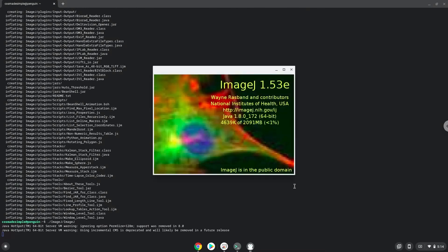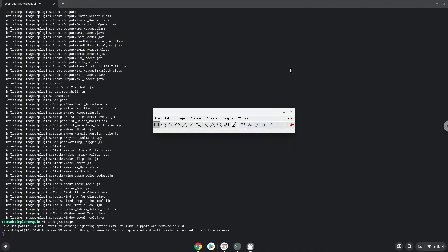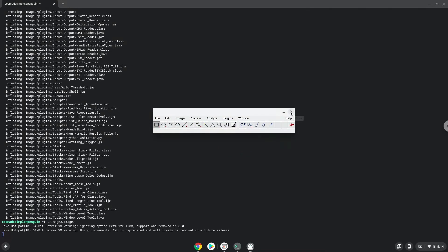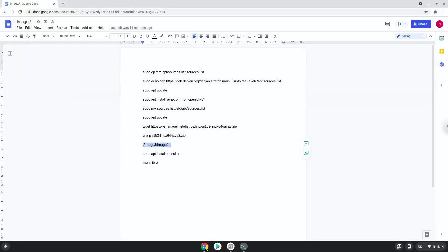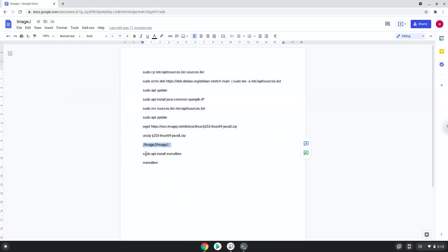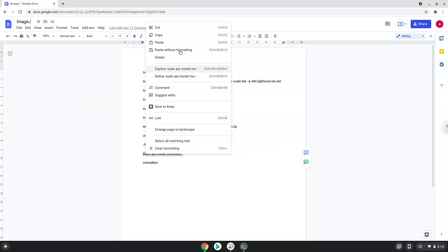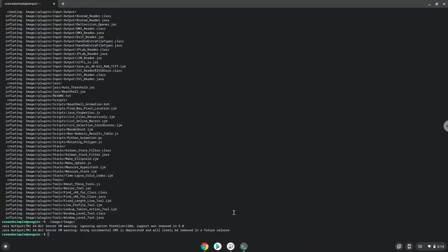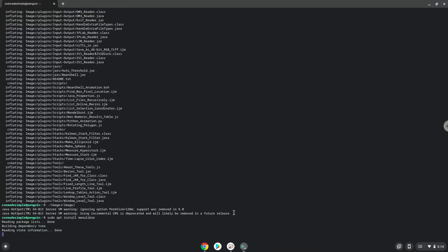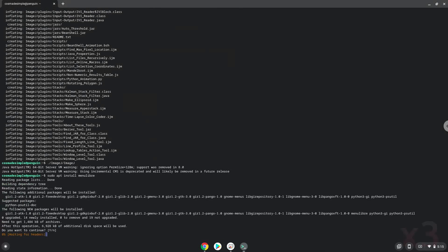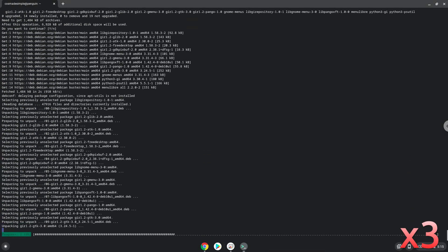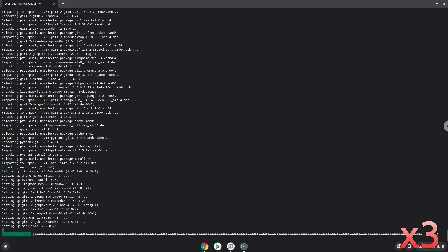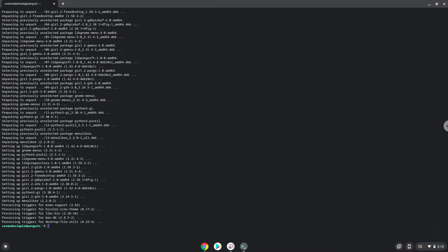Now we will install a menu editor which we will use to add image to our menu. Now we will install the menu editor — press enter to confirm the installation. With the last command, we will launch the menu editor.